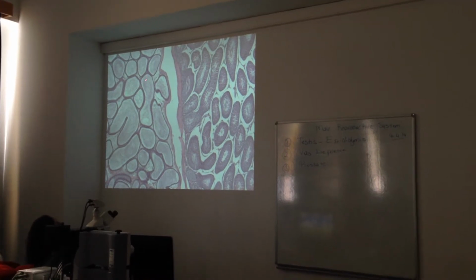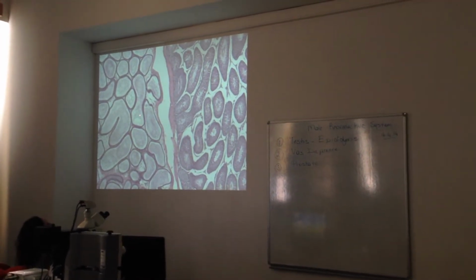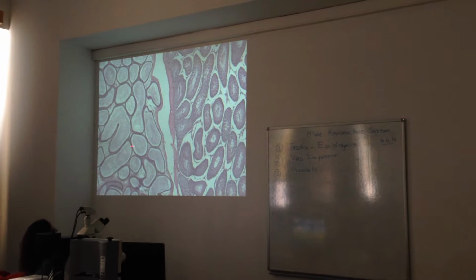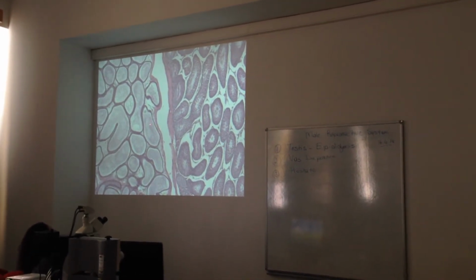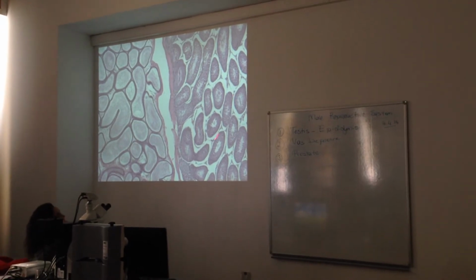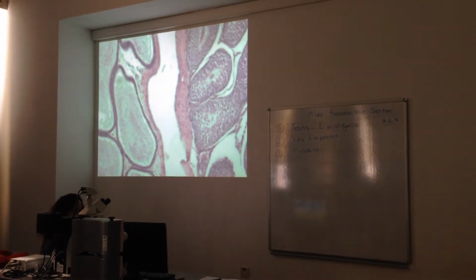At the left, ductus epididymis has a large lumen and it's filled with sperm, because this is the storage site of sperm. Therefore, I can see that many sperm are here, filling the lumen of ductus epididymis, and it has a thin pseudostratified columnar epithelium. Now let's start with testis, and we observe one of the seminiferous tubules to see our germinal cells, the spermatogenic cells.